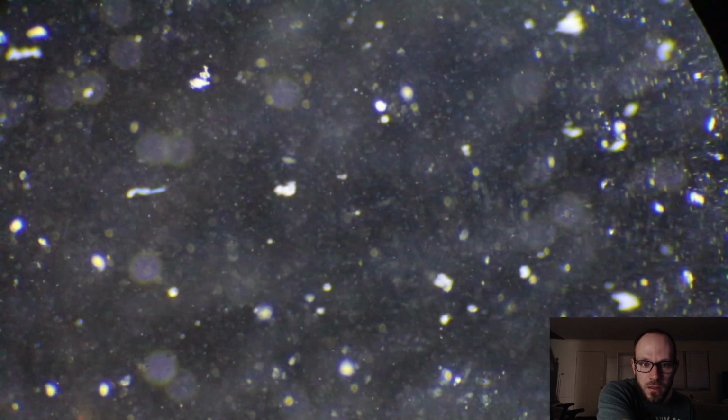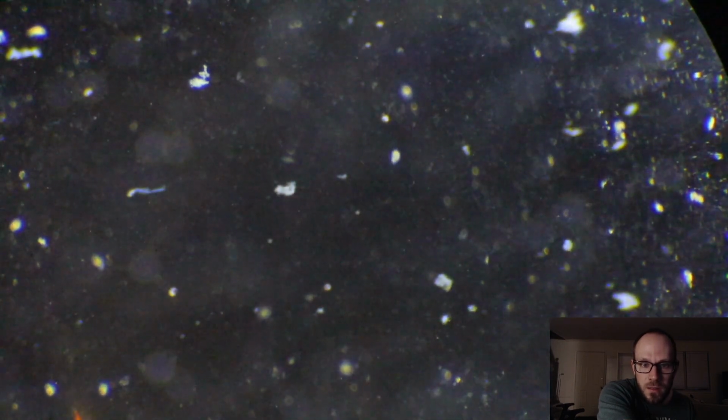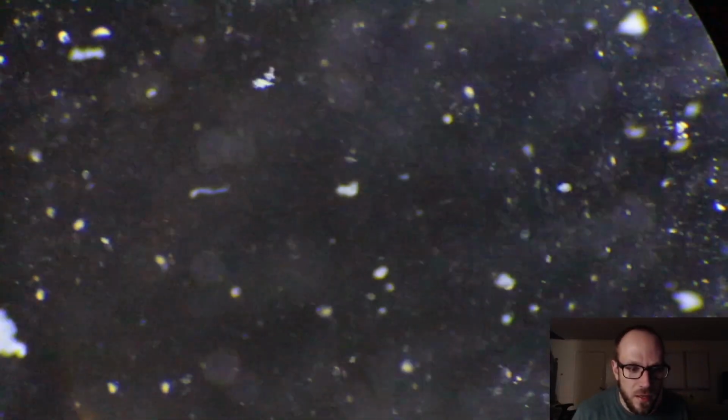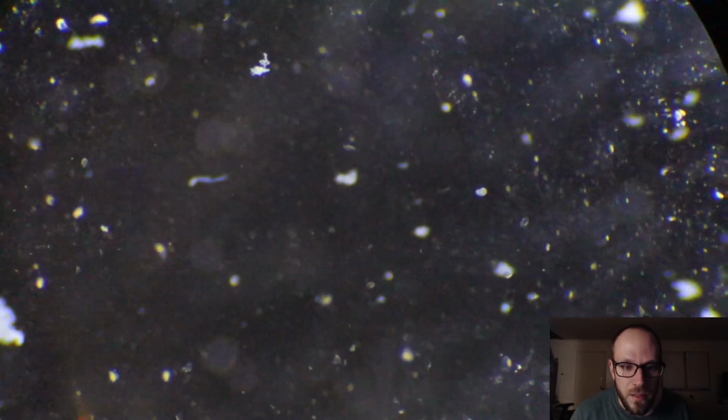All right, we are at the edge of the slide here. All right, we're back at 40x. Oh, there's our friend. Whoopsie. There he is. So yeah, he's cool. Damn, we really are at the edge of the slide. Yeah, he's right inside it. There's two of them. Let's go further in.